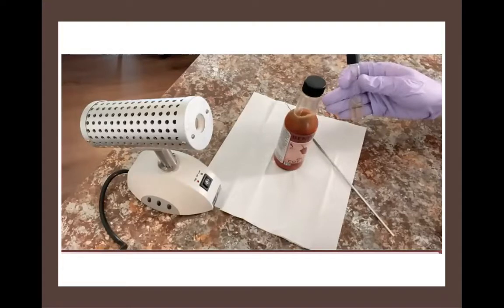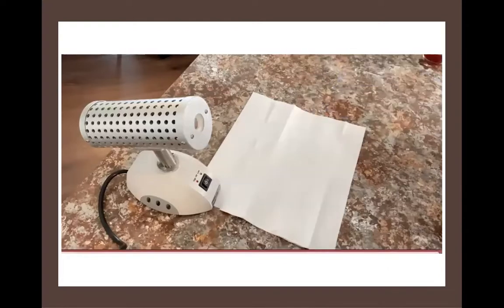It's a very brief pass through the flame. It's going to kill cells that might be on the outer lip of that tube that might be a source of contamination. And it's going to create a current of hot air just in the mouth of the tube, just for a couple of seconds, that will keep that entryway free of contaminating microbes. Now we're going to watch a transfer of cells from one tube to another tube.